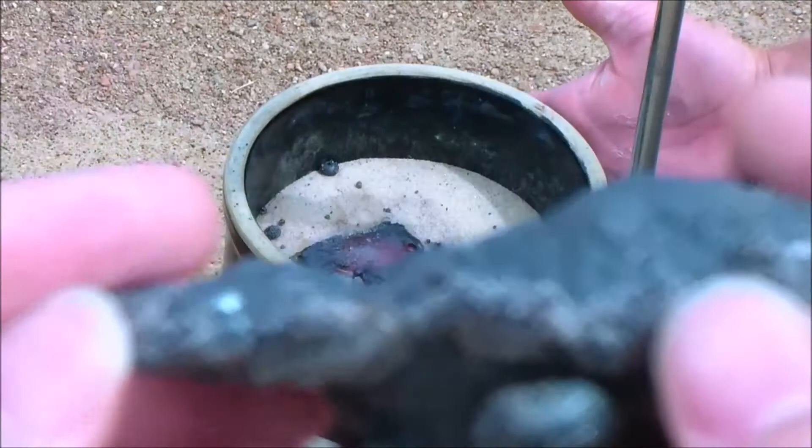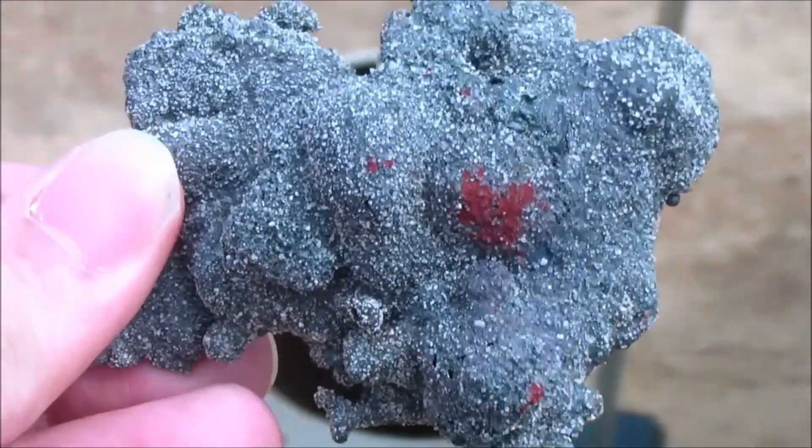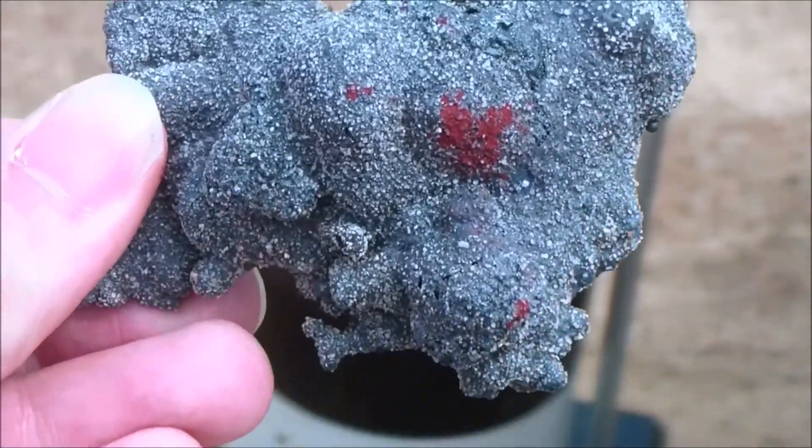And as you can see from this picture, right after the reaction occurred, it immediately cooled down into an iron-like rock. It was very interesting to see the transformation so quickly. We used about 40 grams and it reached well over 2,000 degrees Fahrenheit. I hope you guys enjoyed this video and I hope you guys learned a lot.